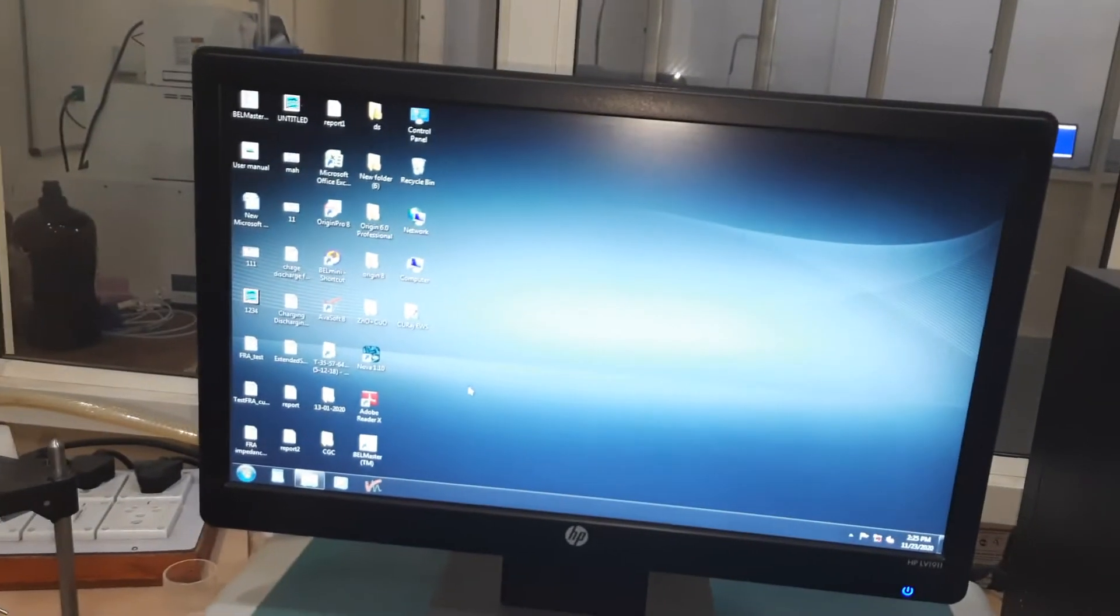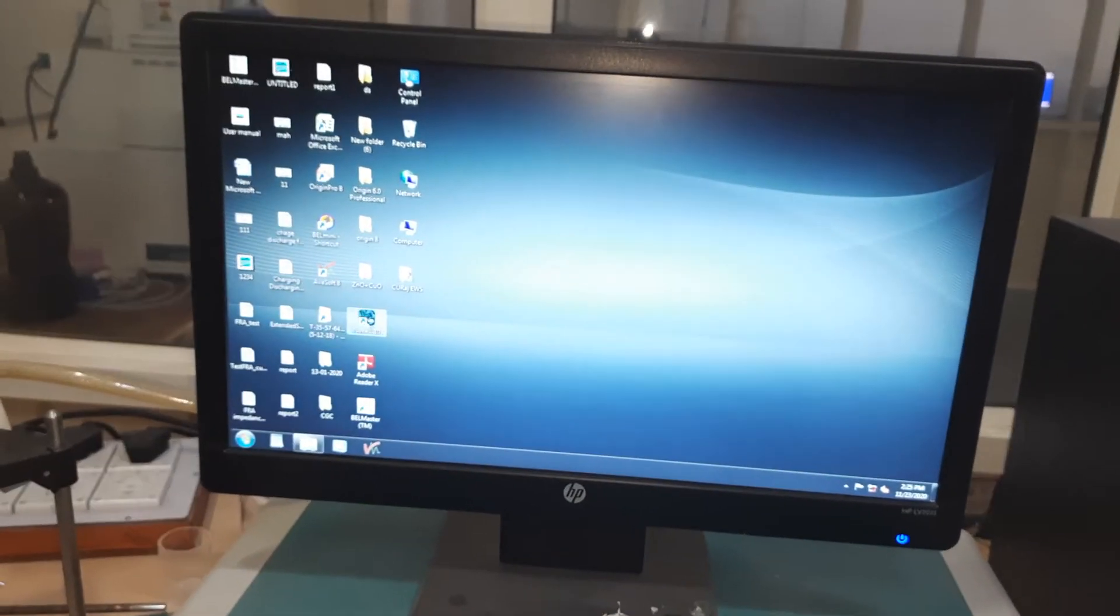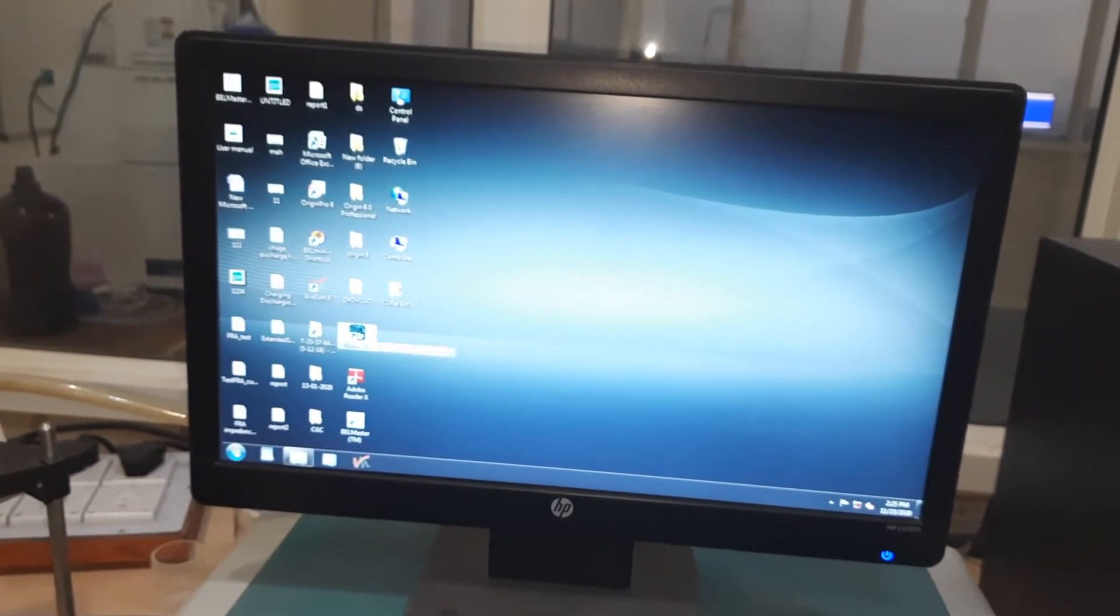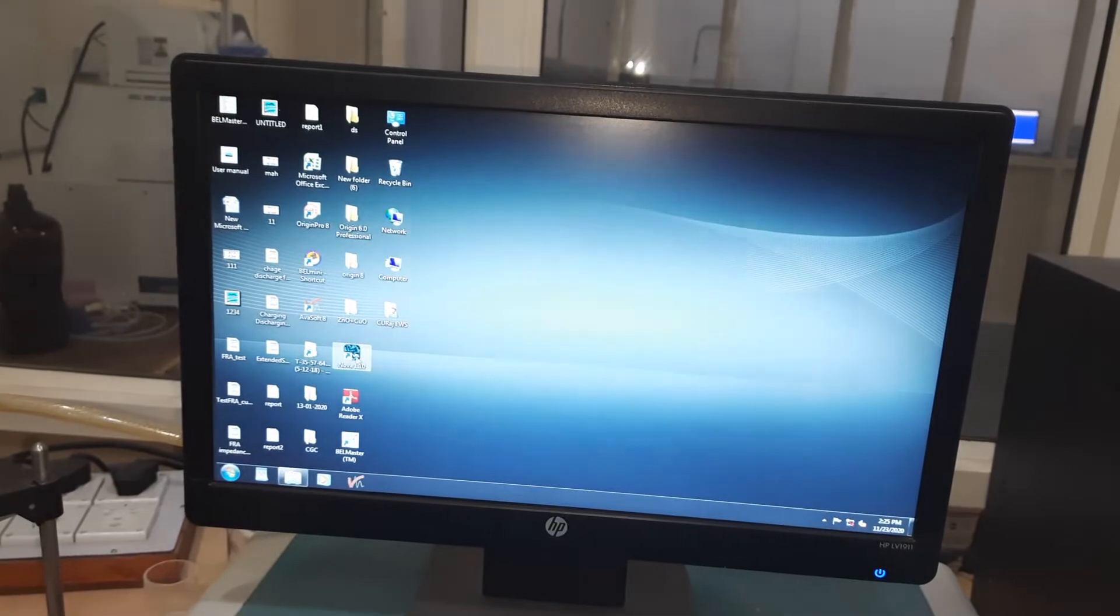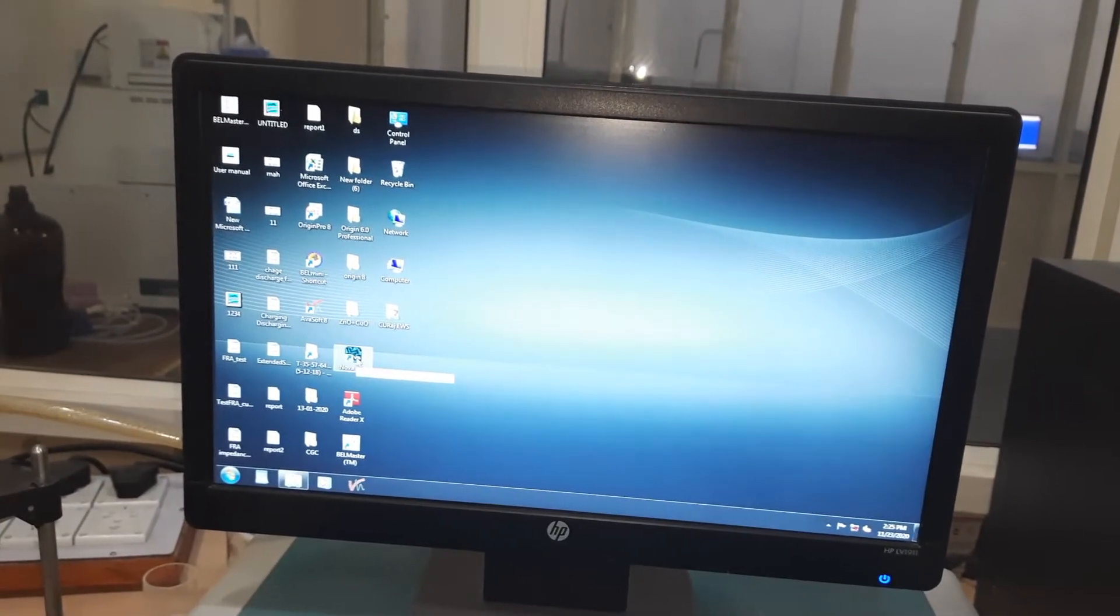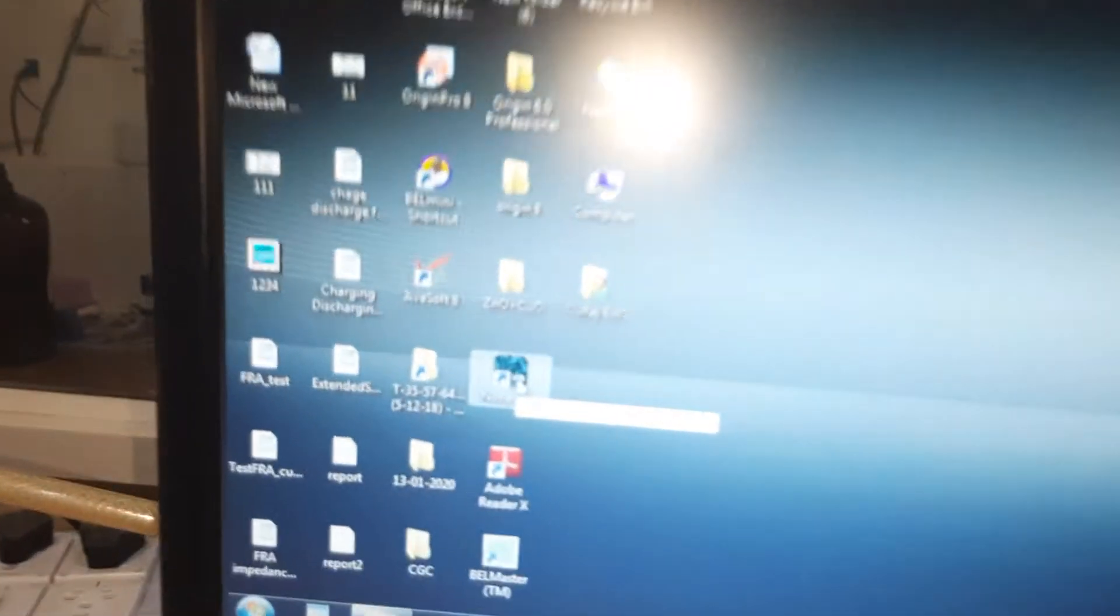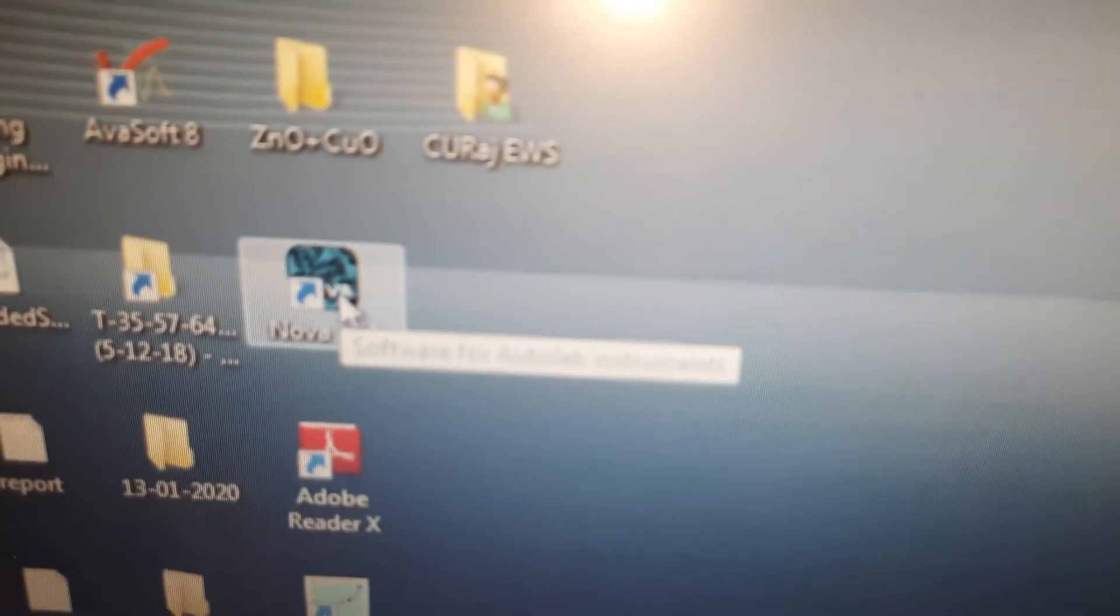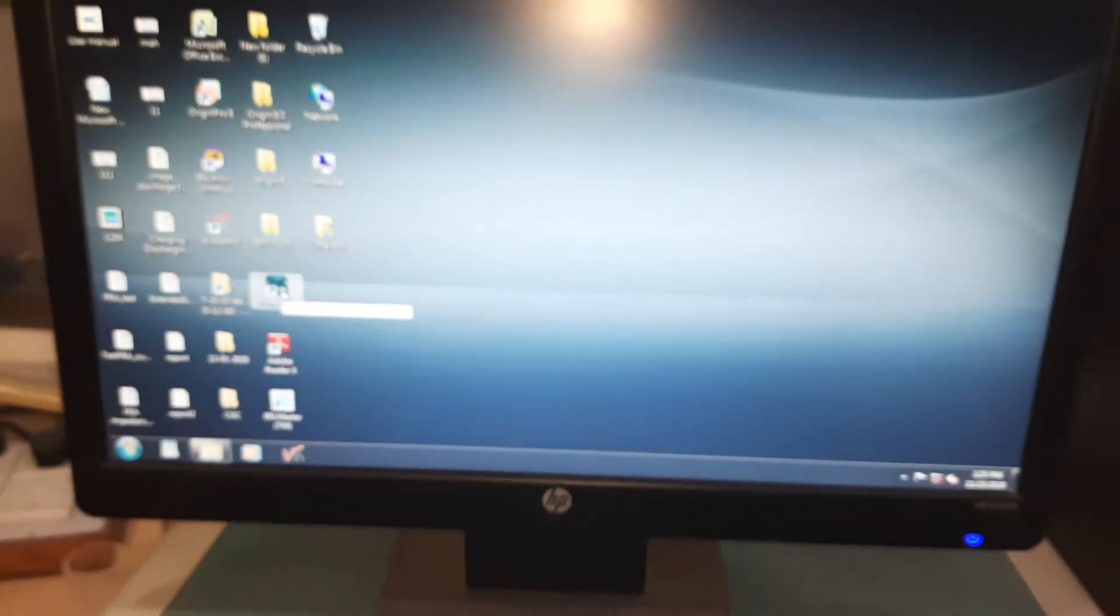Now you can see this label. If I just keep the cursor over here, it shows software for Autolab instruments. Let me click it and that's how it's going to open.